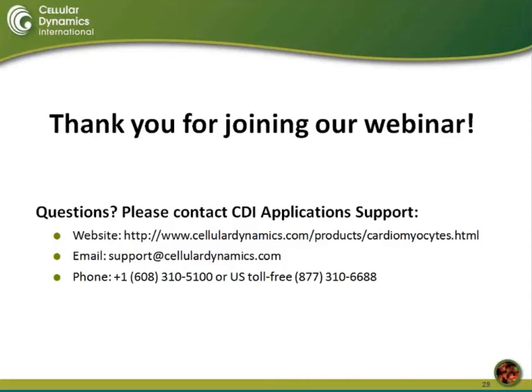Now, the multi-electrode array platform from Axion Biosystems is different from the single-cell patch clamp in that we're able to assess the activity of the network as a whole, so all of our neurons interacting together. And what Axion's platform really allows us to do is work in a relatively more high-throughput manner than the single-cell patch clamp. In this case, their Maestro system is a 48-well platform, and we're able to directly culture our cells on these plates and monitor them out to longer term in culture.